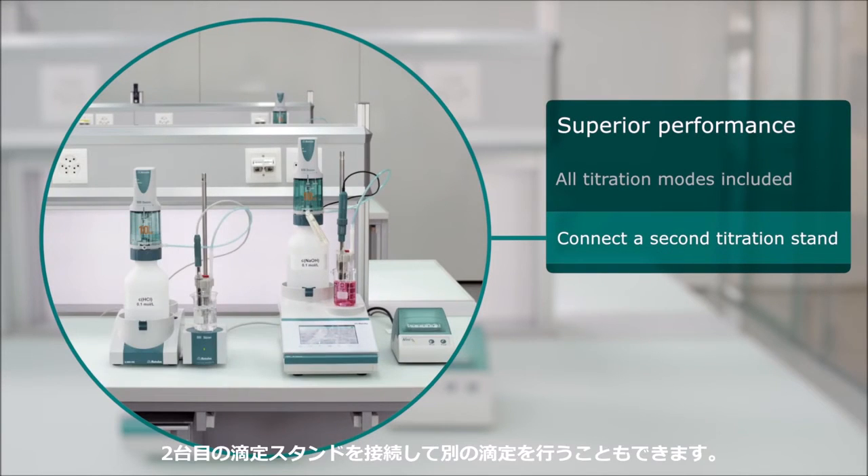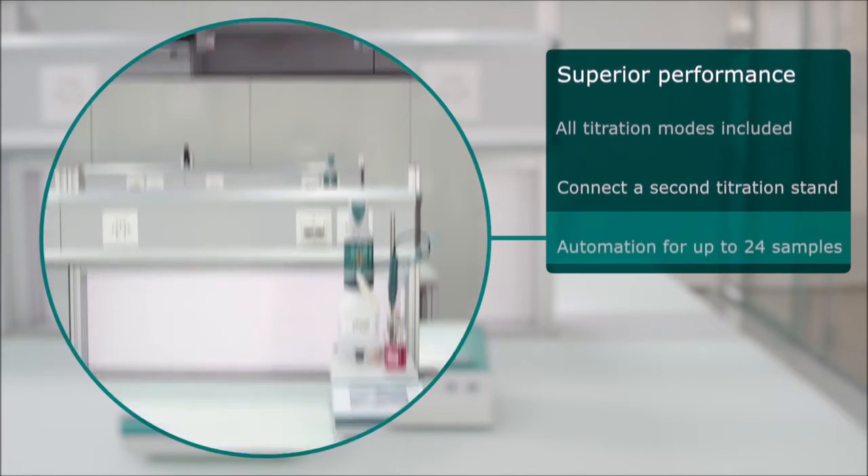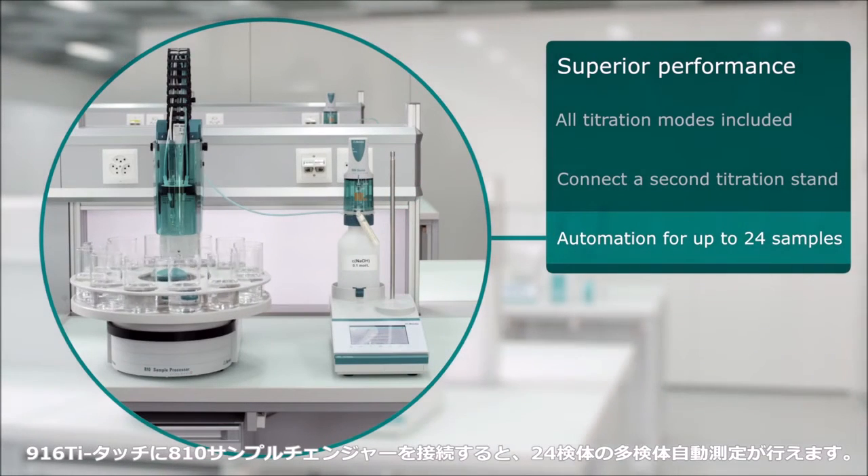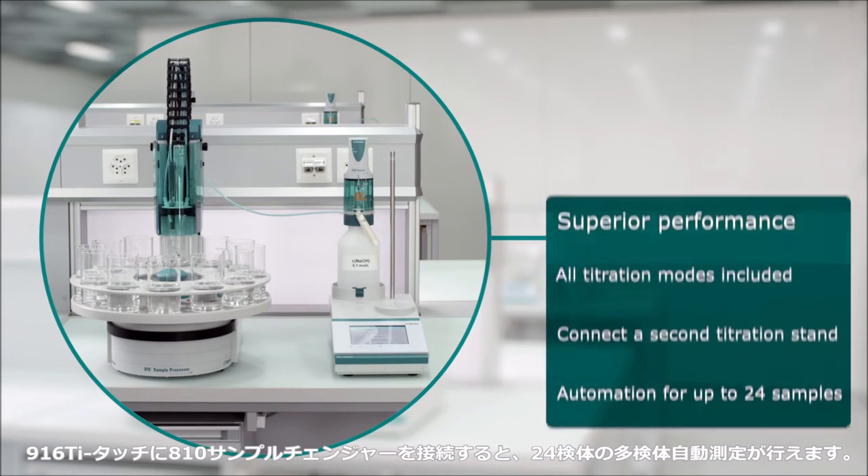Connect a second titration stand for another application anytime. To increase throughput, simply connect your 916 T-Touch to the 810 sample processor to analyze up to 24 samples completely unattended.